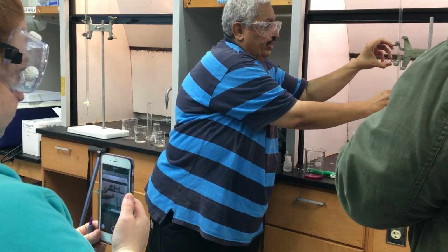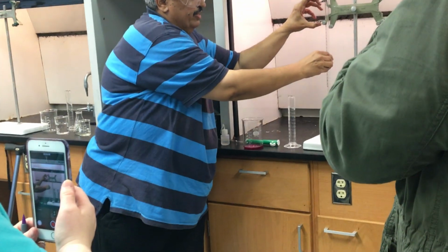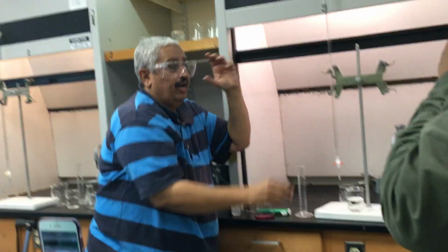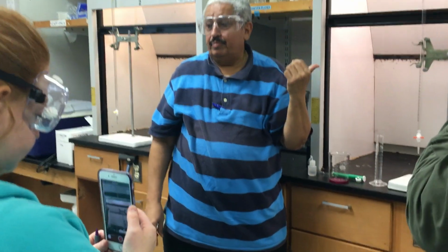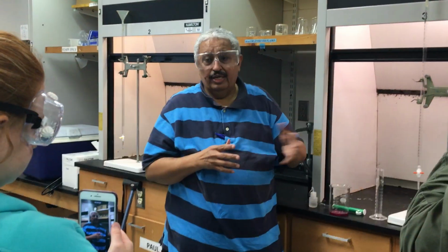Be very careful here, and don't let it go and break the burette. It's very expensive glassware, and it's the best calibrated glassware we know: burettes.